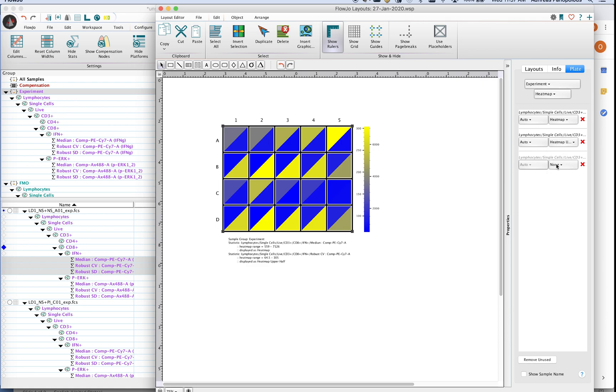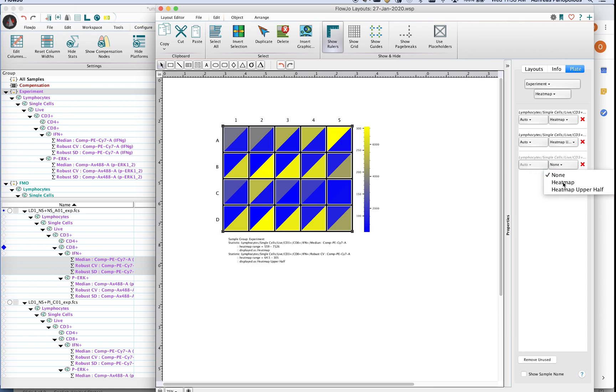You can turn only two statistics on at a time in the heat map version. So if you go to the grayed out section you can see here that it says none. If you go ahead and select heat map or heat map upper half.